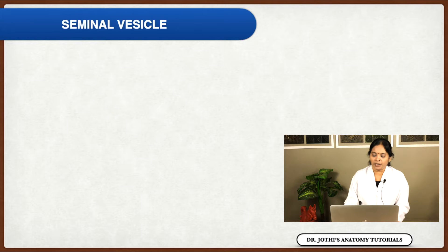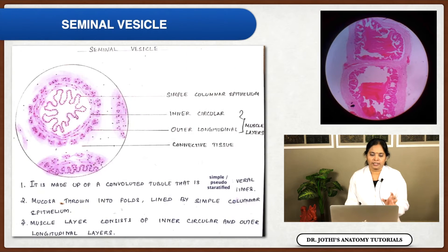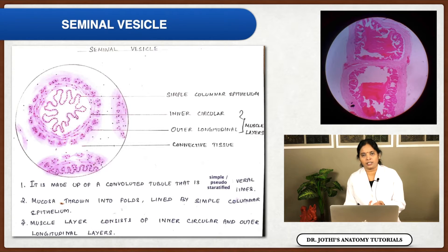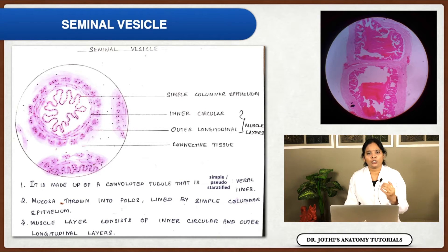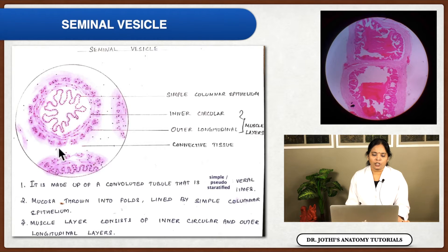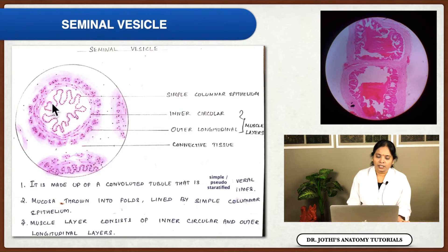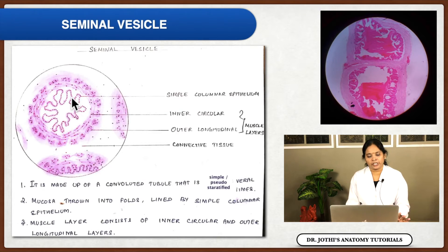The next structure is the seminal vesicle. It is a sac-like glandular structure and an accessory sexual organ. Since it is a highly coiled structure, when you take a section you will see many sections of convoluted seminal vesicle tubules. It is lined by simple or pseudostratified columnar epithelium, and the mucosa is thrown into many folds.